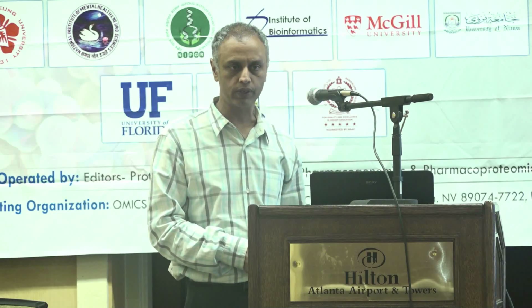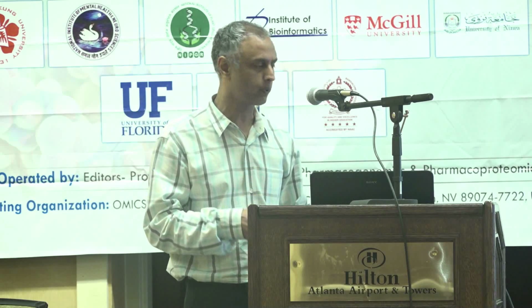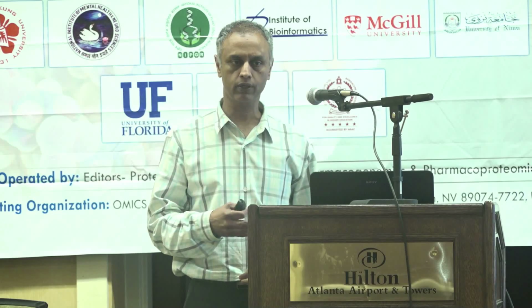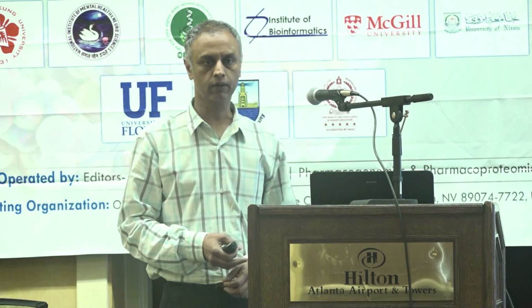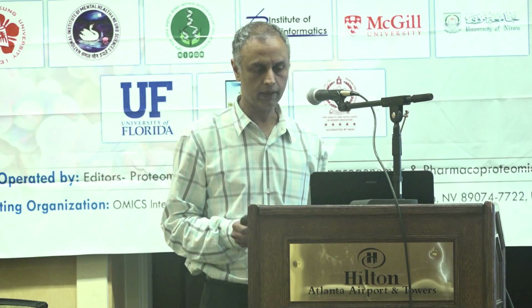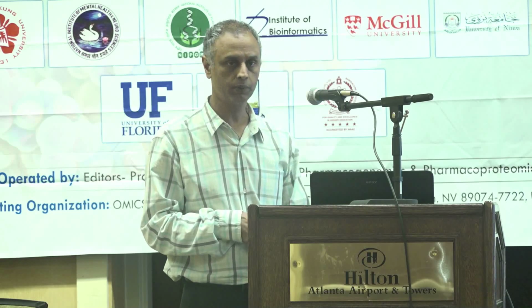Here we are doing more research into how we can catch the peptides that correspond to mutant protein products. But we can use whole genome sequencing to, again, jump to the conclusion of whether or not the strain that has infected a particular human being or a patient is supposed to be resistant.